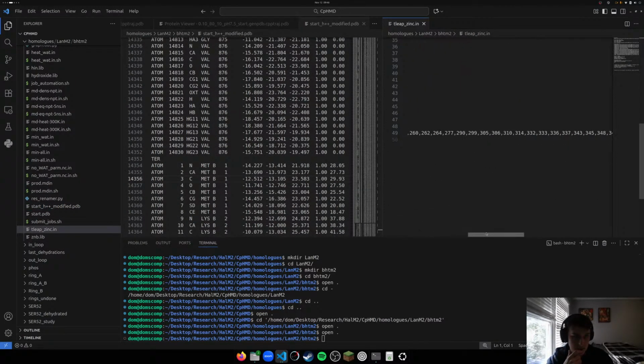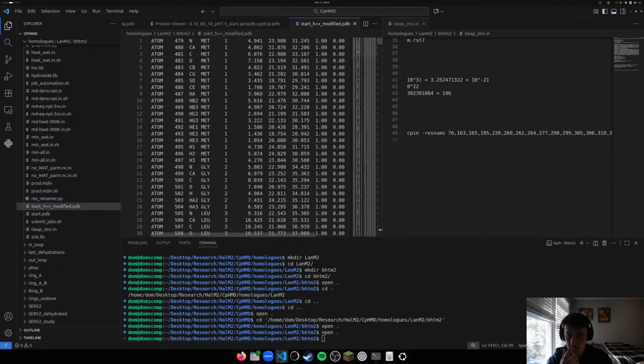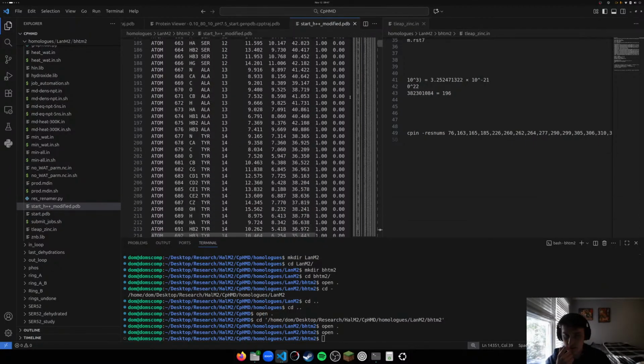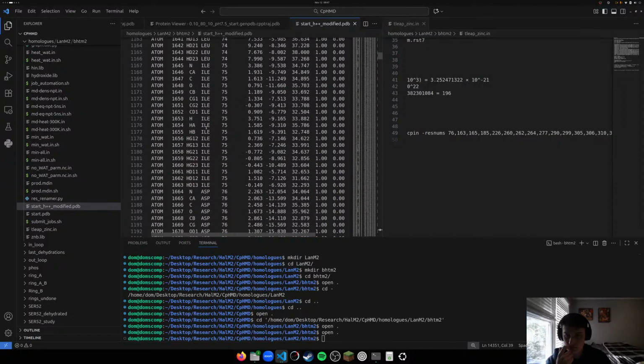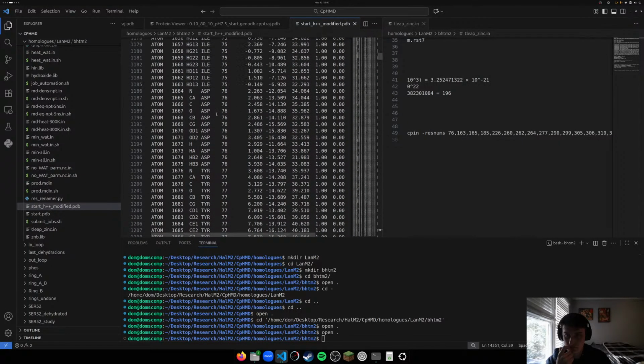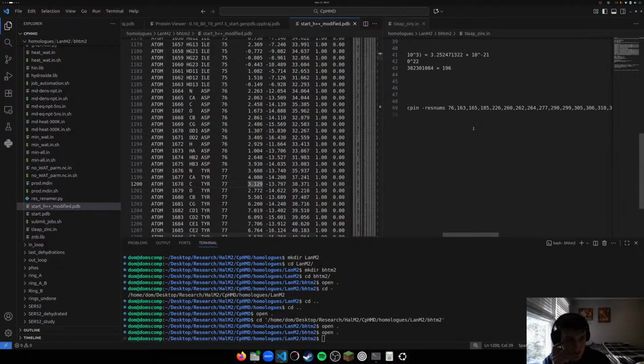Oh, I might be too lazy to automate. Let me see how bad this feels first. That already feels bad. I don't feel like doing that.